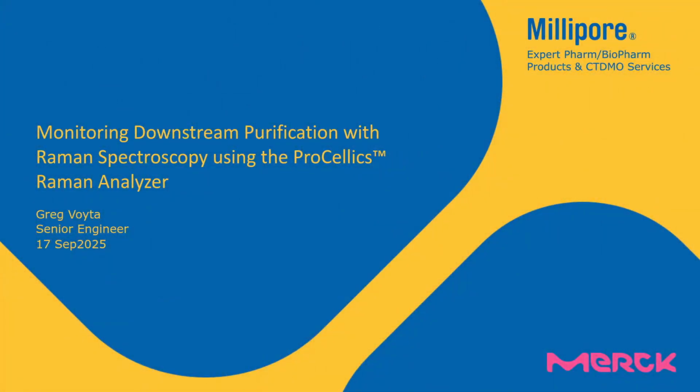Thank you, Marcus, for the time. Today I'm going to be providing an overview for our next presenters and providing some background around Raman spectroscopy and tangential flow filtration, and how we see that combined offering being of value when monitoring downstream purification.